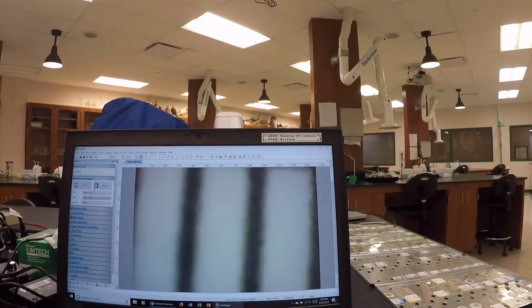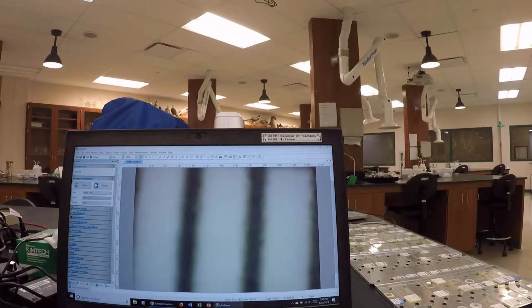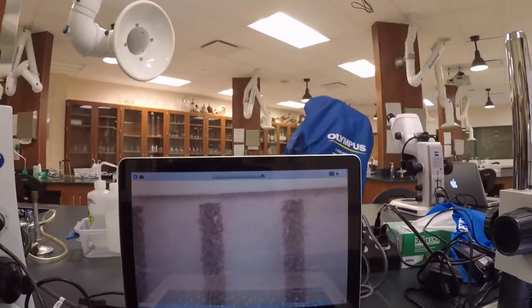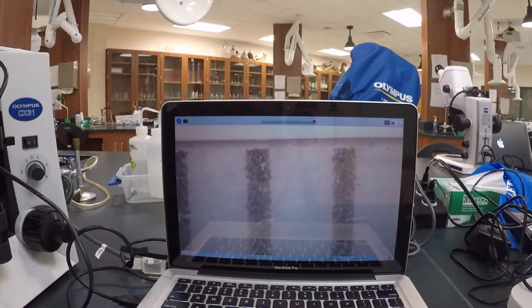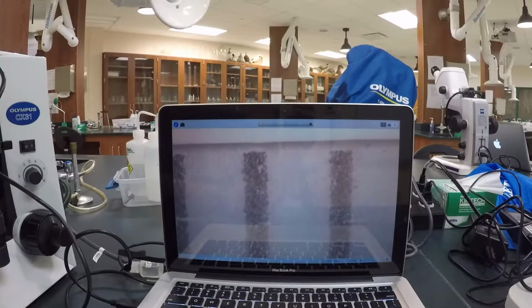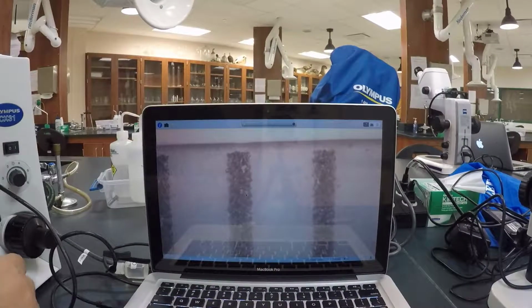This is 4.5, or 45 times your eyesight. According to the computer screen, we have 3. That's the easiest way to show you the data, so I'll just use the computer screen to show you the data because you won't be able to see it through the eyepiece. So here is the lowest. This is 40 times your eyesight. Again, this is roughly 3, almost 3.